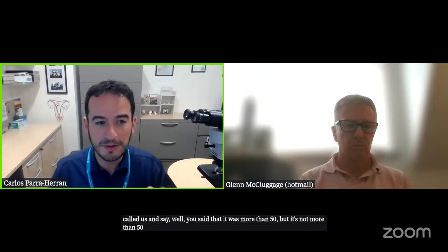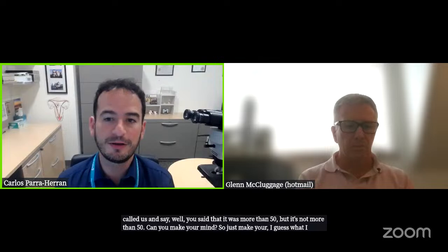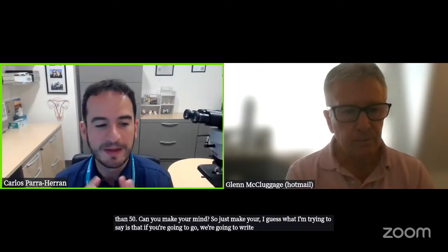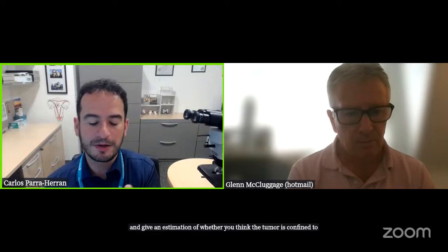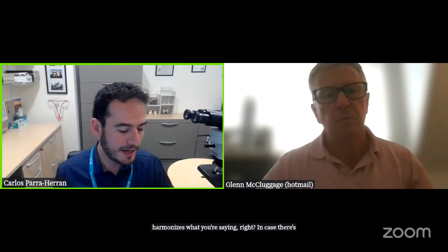Can you make up your mind? So what I'm trying to say is that if you're going to write a gross description and give an estimation of whether you think the tumor is confined to the endometrium, superficially invasive or deeply invasive, make sure that your final report harmonizes what you're saying, in case there's a discrepancy with the micro.